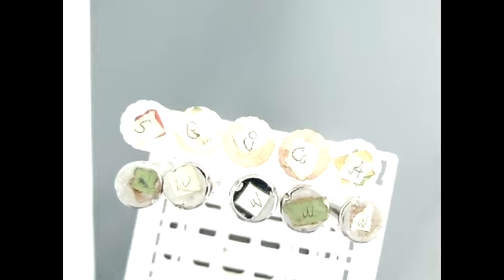The first thing we have to do, it says, to evaluate the results of the chemical tests that you will perform on the substances provided, it is necessary to prepare a set of standards that demonstrates both positive and negative results for each test. The standards are prepared by performing each test on A, a substance giving a positive reaction, and B, a substance, which in this case will be water, giving a negative reaction.